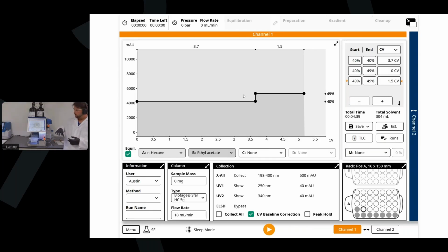So the way that it operates is as your sample is flowing through the column, it then gets routed through the ELSD or sampled through the ELSD. We do have one of the smallest sampling rates. It is a destructive technique, so we do have the smallest sampling rate on the market. So that's intended to not use your sample, but still give you that information that we're seeing either something's coming through the system or not.